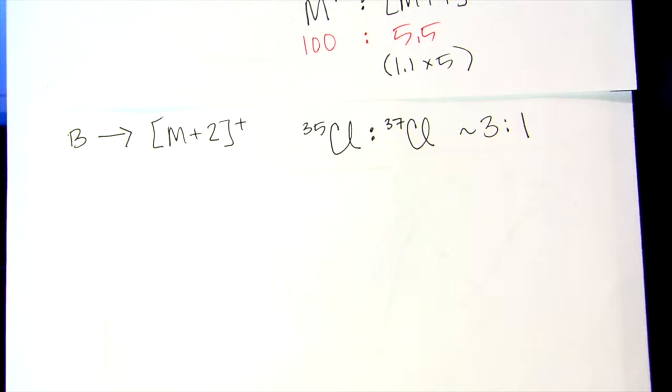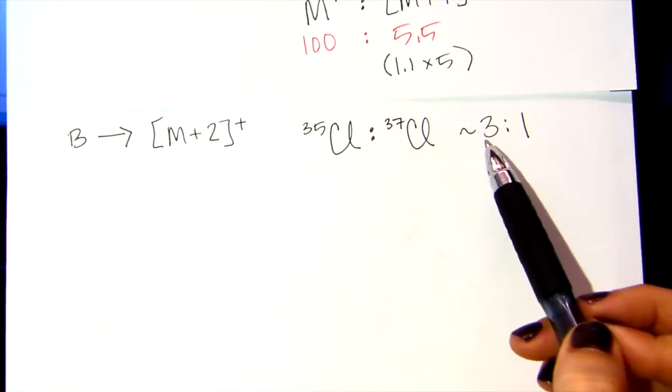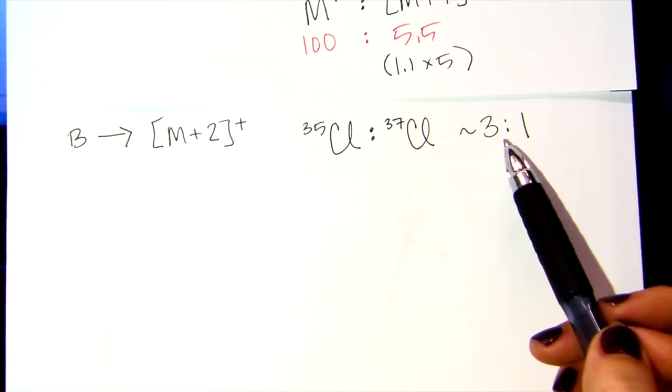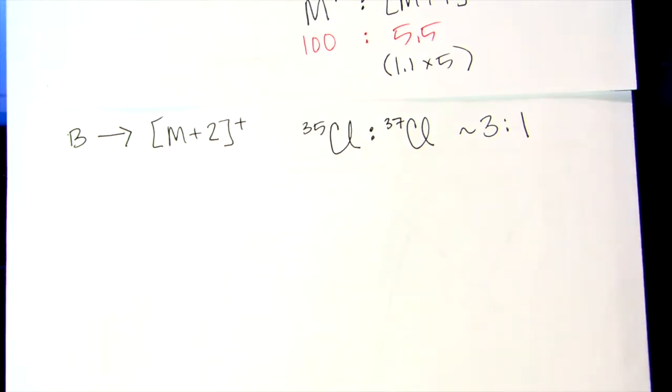And so that's a very distinct isotope pattern because that's pretty significant, right? So if you see your mass peak and then you see a second peak at M+2, and they're in a ratio of 3 to 1, that's a signal that you have chlorine in your molecule, right? So just seeing that ratio, okay? And so there's an example here at the bottom of page 3.